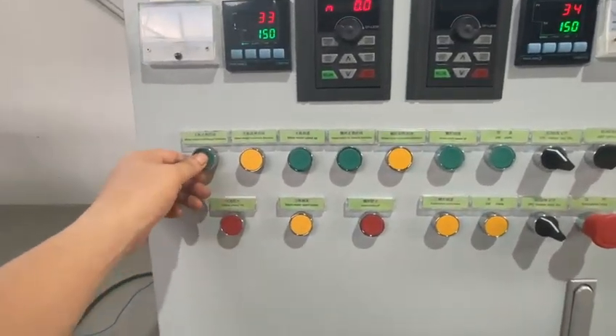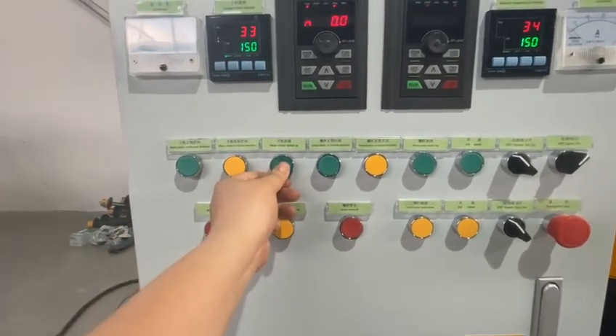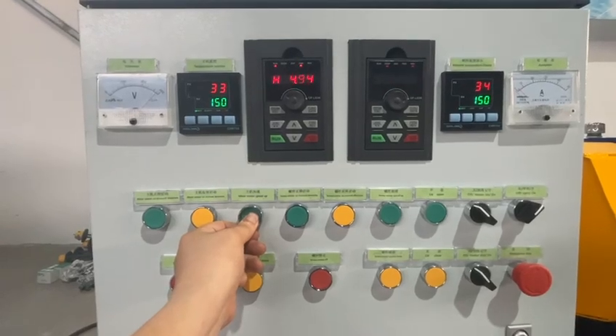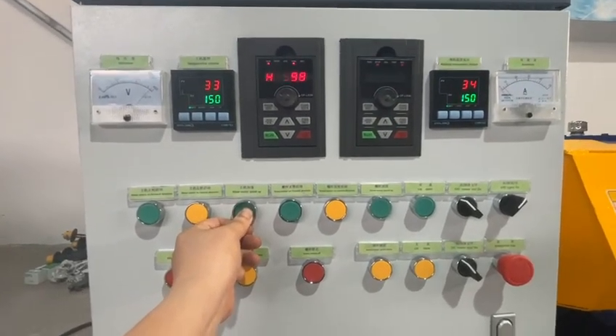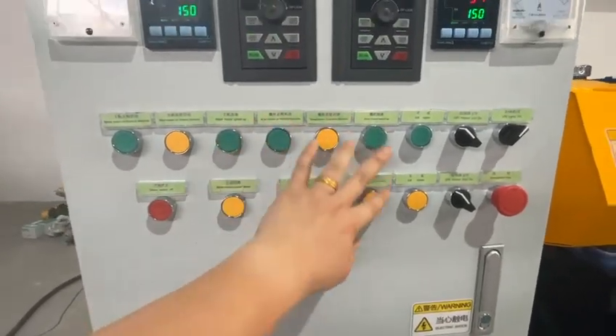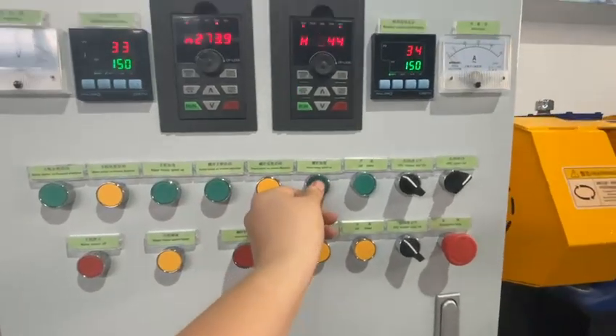First, we test the double Sigma blades mixing forward, speed up. At the same time, we test the discharging screw function — screw forward, and give it some speed.